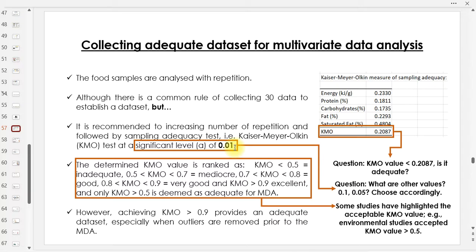Unfortunately, starting from 2006, publication related to halal until 2013, I think, most publications still use 0.05. They allow 5% errors lah. So if you allow 5% errors, meaning that 95% of your data is correct, is not precise enough to make a database lah.